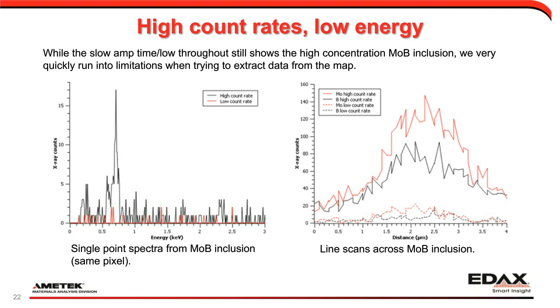Now again, this is 1.6 milliseconds, so this means I acquired my boron map in a couple of minutes. Most of the time, mapping boron is something that takes a significant amount of time, and increasing my acquisition time, of course, will give me better statistics. But the point of it is to show that going faster gives significant benefits for light elements as well, as long as you can distinguish them above the noise level in your pulse processor, and you actually get meaningful data in a very short amount of time.